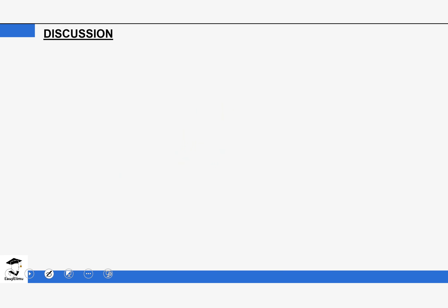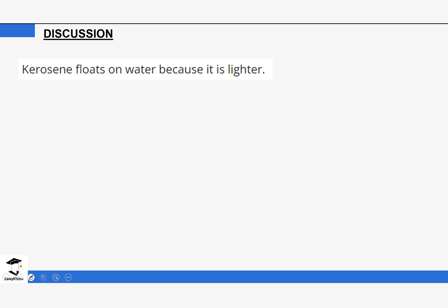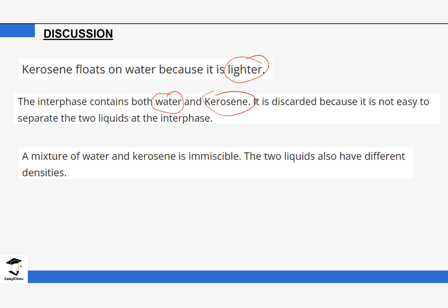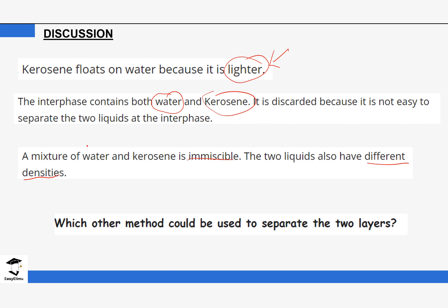In the separating funnel, the lighter liquid floats and the heavier one goes to the bottom. Kerosene floats on water because it is lighter — it is important to remember this property of kerosene. The interface is a mixture of water and kerosene and is discarded because it is not possible to separate these two liquids from it using the separating funnel again. The two liquids are immiscible and have different densities, which is why kerosene goes to the top and water stays at the bottom.